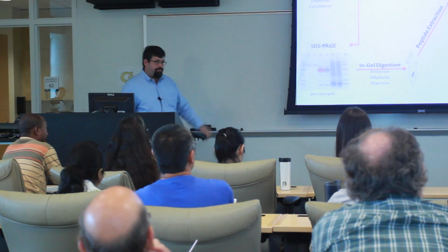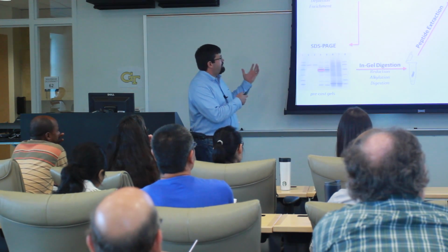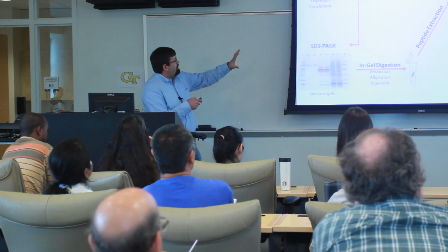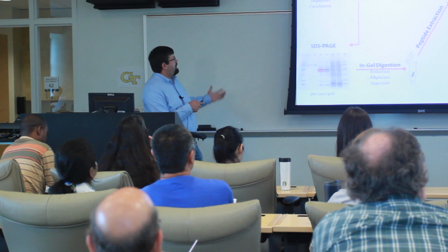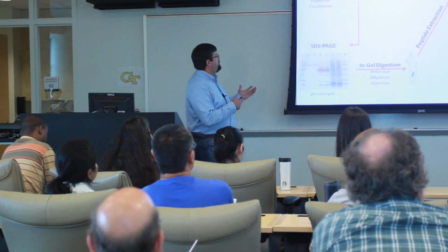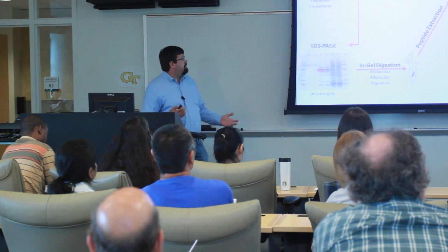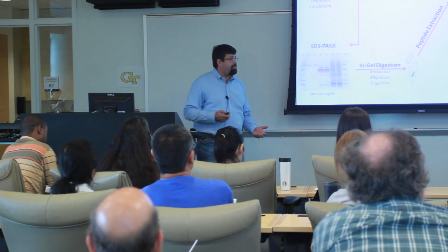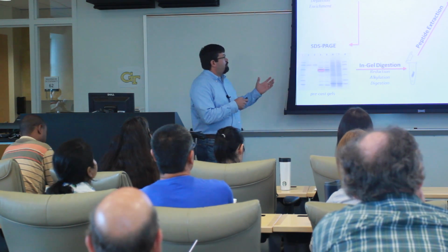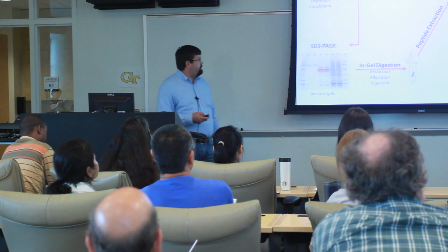Typical workflow. If you're working with proteins, you know about SDS-PAGE, you know about lysates. Let's start up here in the top left. I know there's a lot of arrows, but a typical experiment might consist of lysate prep. You lyse some cells, maybe you do some fractionation, maybe you deplete, maybe you have a tag on a protein of interest, and you enrich, and that leaves you with some protein in a buffer of whatever choosing.